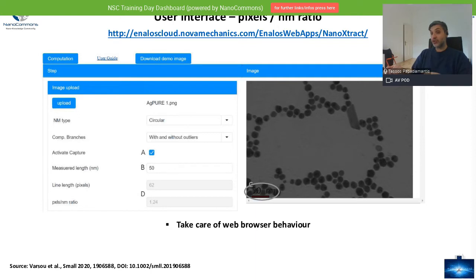On the other hand, if you use Firefox, what happens is a bit different. Firefox automatically zooms out the image, so you will see the entire image. And in this case, there's a big danger, because it's not a full-scale image. When you perform the scale capture step, you will actually need to zoom into the image. As we're going to see, when you do that, you will get a magnifying lens that allows you to zoom into the full-sized image and perform the scaling. If you do not do that, and you perform the scaling on the zoomed image, then your results will be totally off. We will run an example so that you can see the difference in the values. But be very careful when you use this tool, so that you always do the scaling using the full-sized image.